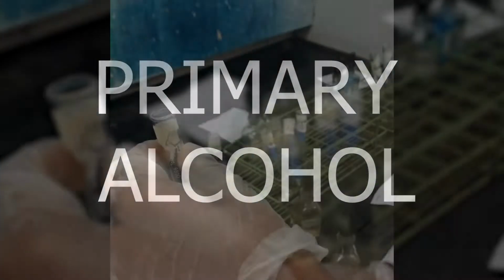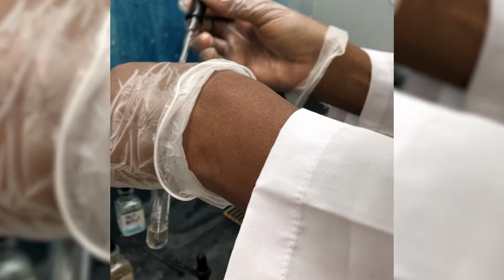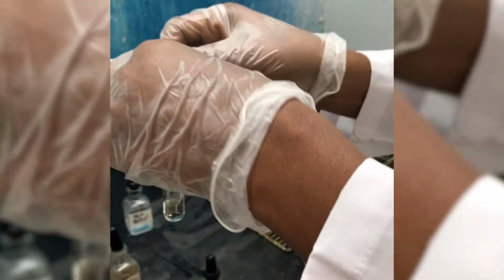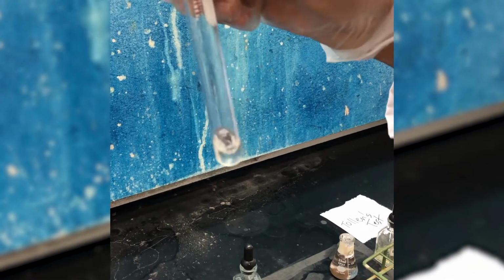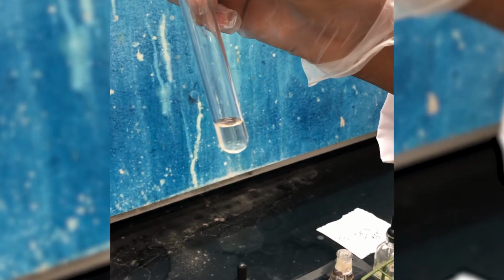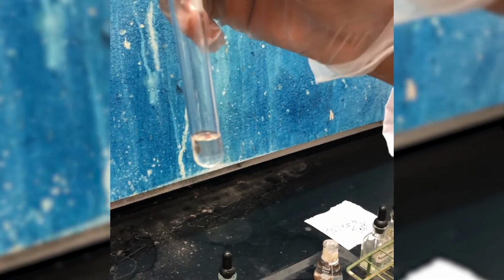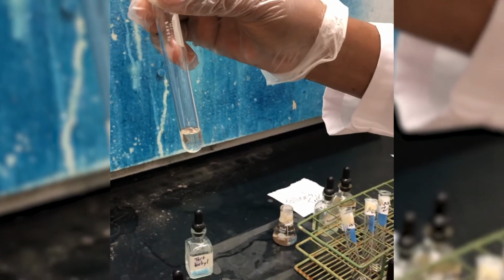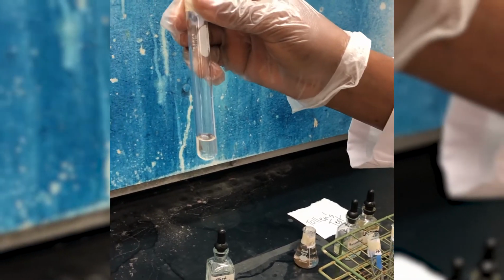Now for the primary alcohol, just add the Lucas reagent and watch what happens. For the primary alcohol, it takes so long to react with the Lucas reagent that we say there is no reaction.